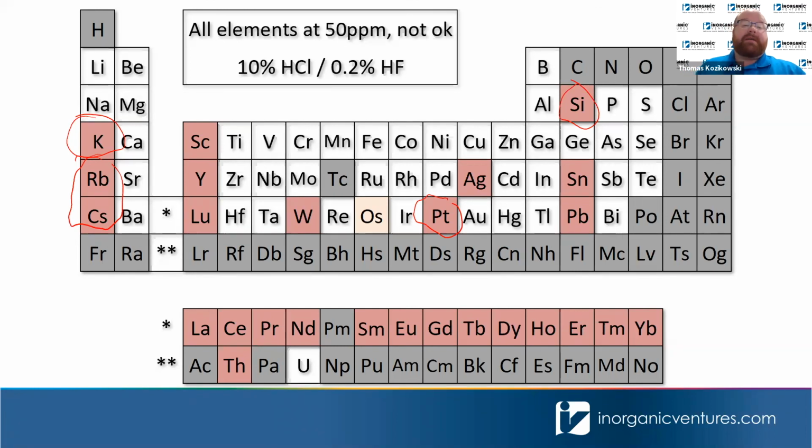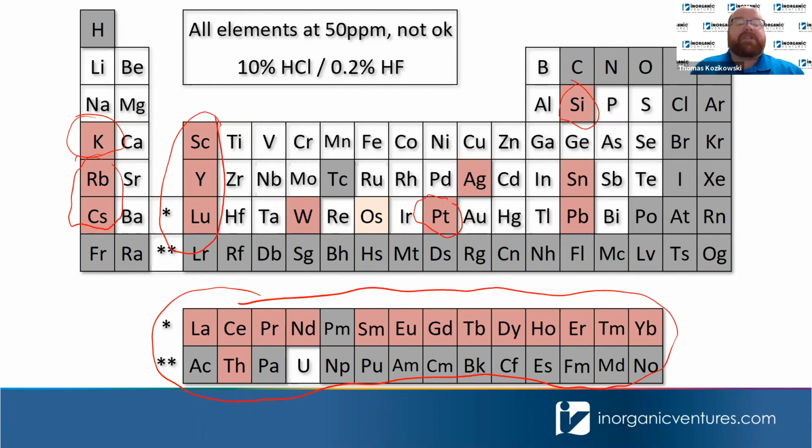Obviously, a major one is HF with all the rare earths. So all of these do not play well with HF when you get above 1 ppm. Thorium is the worst, but all of them will precipitate at some point. And of course, if they're precipitating, they're stealing HF away from elements that need it. So that's where tungsten and tin come into play.